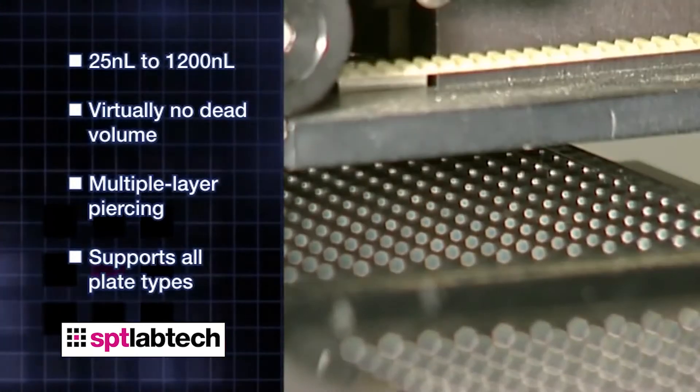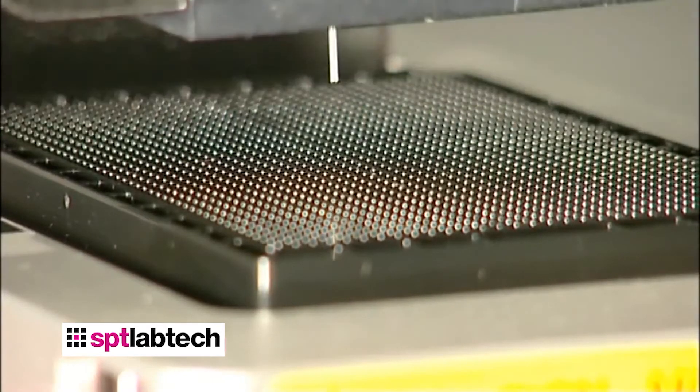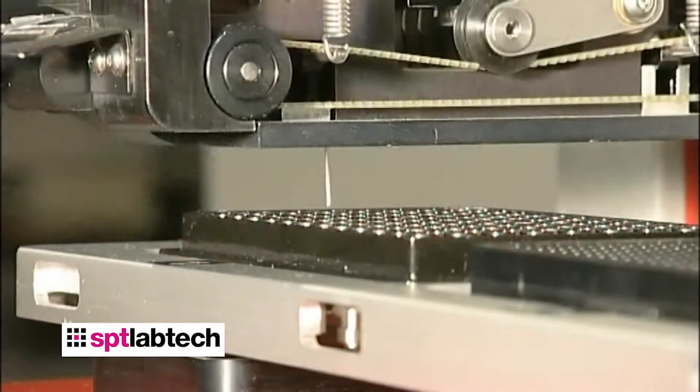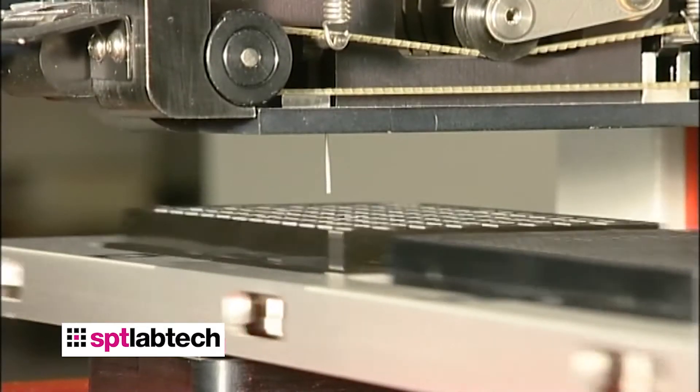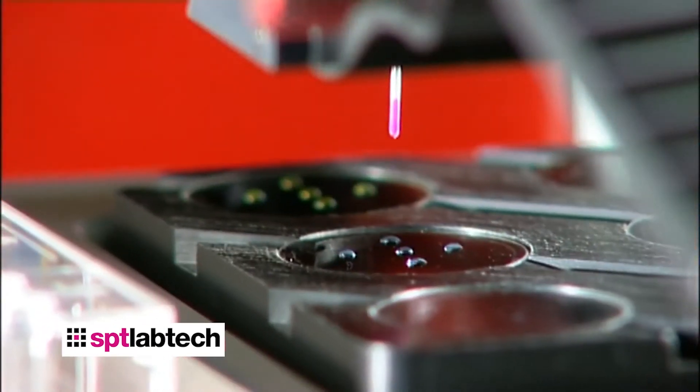It supports all standard plate types, from 96 right up to 1536 plates. The five-position deck provides a high degree of process flexibility by allowing transfers between different density plates.